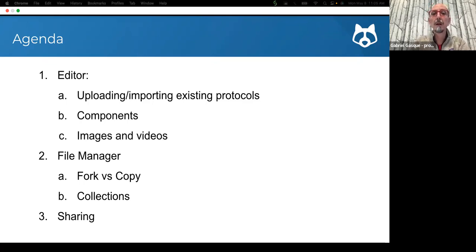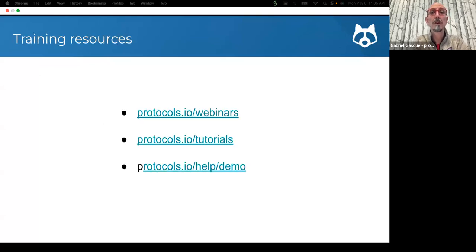This is not an introduction to Protocols.io. This is an advanced webinar and presumes some basic knowledge of the platform. In case you are not familiar at all with Protocols.io, I would invite you to visit the different resources that we have for training that you can see on the slide now.